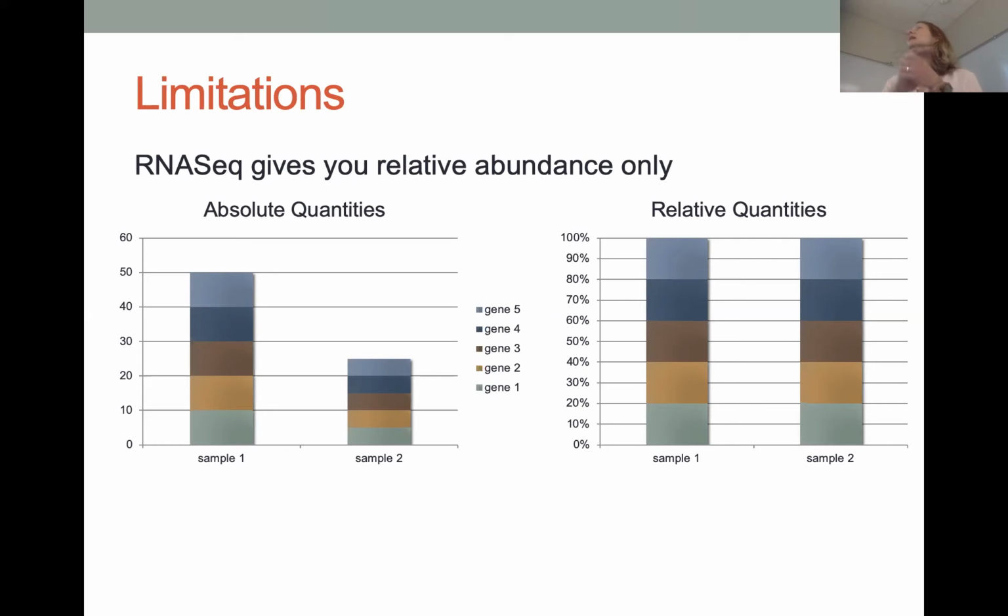But you can kind of avoid this mess if the only question you ever ask is, what is this gene doing between my two samples? So you're trying to compare apples to apples. So gene A, if it has multi-mapped reads in sample 1, it's going to have multi-mapped reads in sample 2. So if your experimental question is, is gene A up or down regulated due to my treatment, you're good.